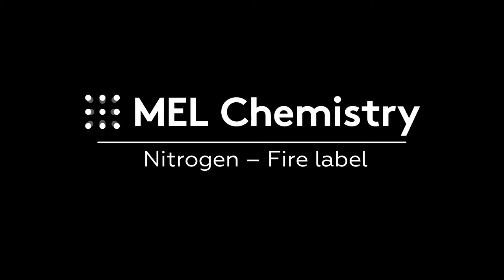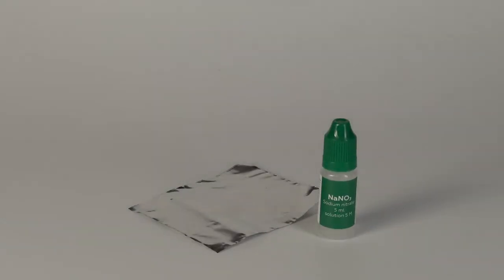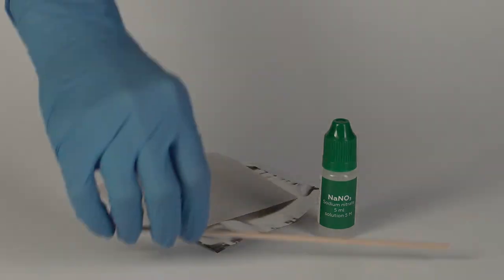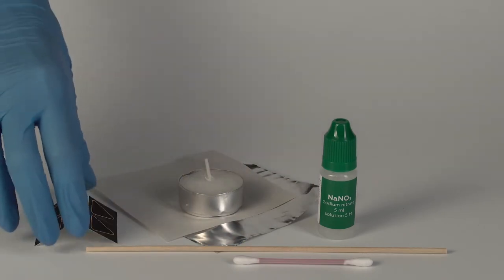For the fire label experiment, you will need the sodium nitrate solution, a piece of foil, a sheet of paper, a splint, a cotton swab, a candle, and thermochrome stickers.